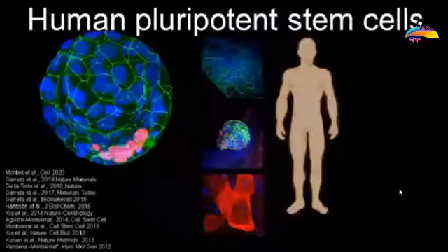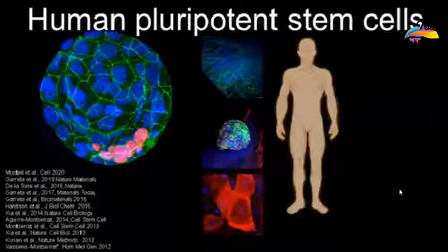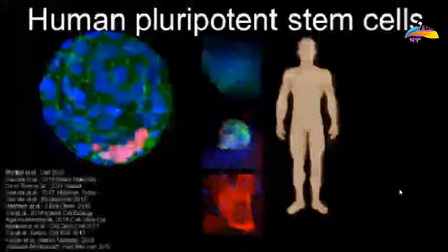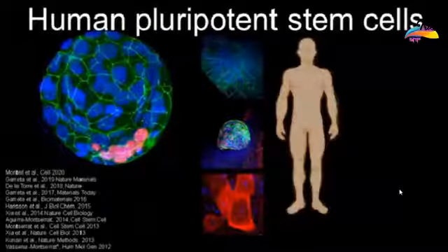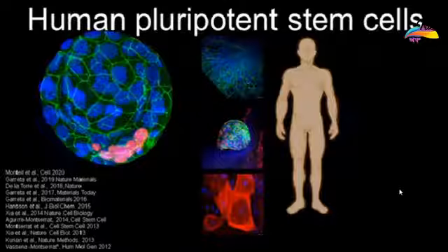I would like to present part of our work for the creation of kidney organoids from embryonic and pluripotent stem cells as an infection model for SARS. Human pluripotent cells, including both embryonic stem cells derived from human embryos and induced pluripotent stem cells, have the inherent capability to give rise in vitro and in vivo to cells of the three layers of the embryo.